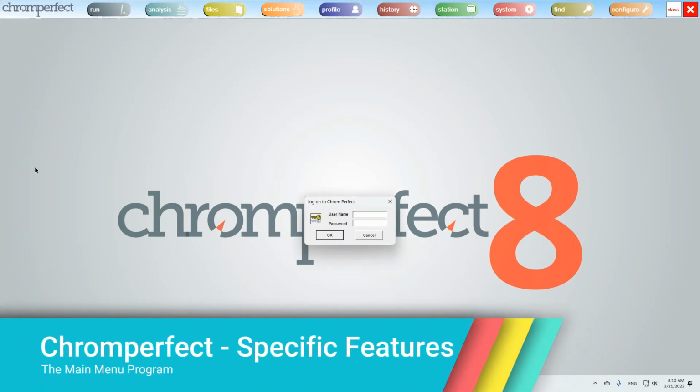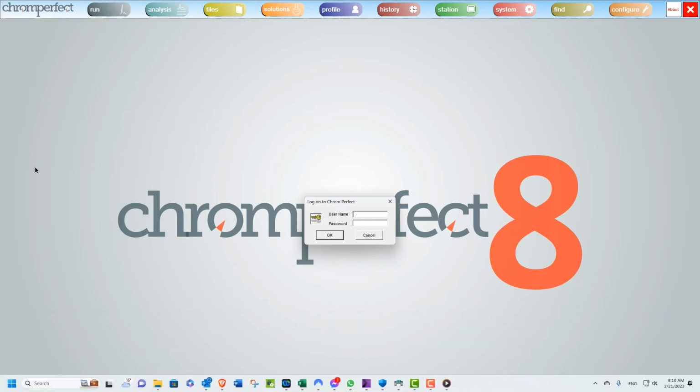The main menu program. When a user initiates a Chromperfect session, the main menu is normally the first program to be launched. The other Chromperfect programs are normally launched from the main menu program. When the main menu is launched, the taskbar appears. Depending on its configuration, the buttons may appear with icons or with captions and background colors of your choice.